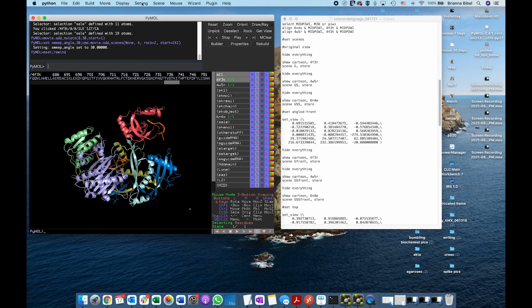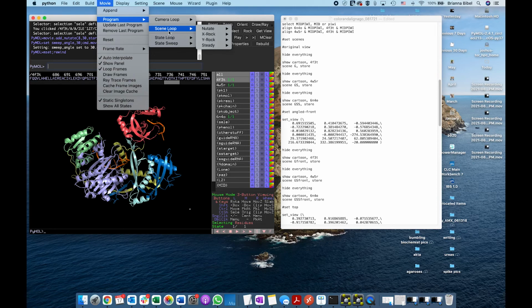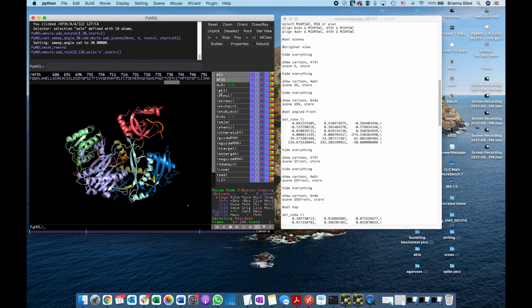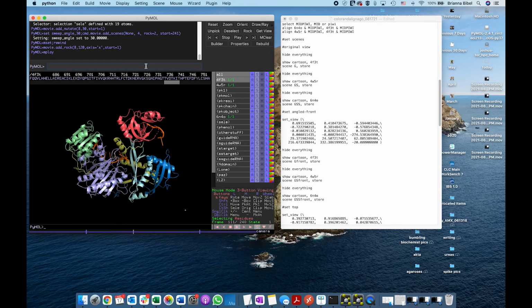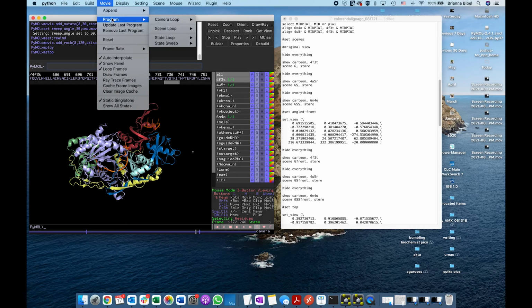Okay. And now we'll do movie. You can see, if you do X rock, you'll get, and then you can have a movie play by pressing M play, or you can press play. So this is rock, M stop, and you can also have movie.